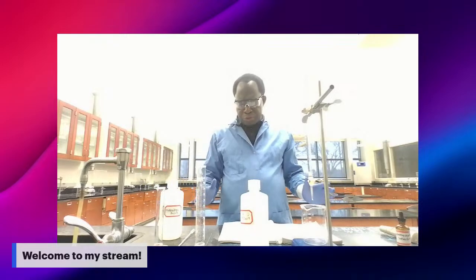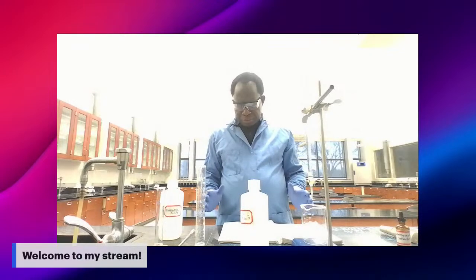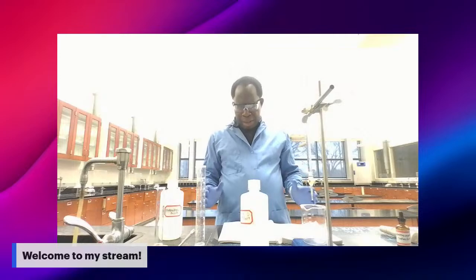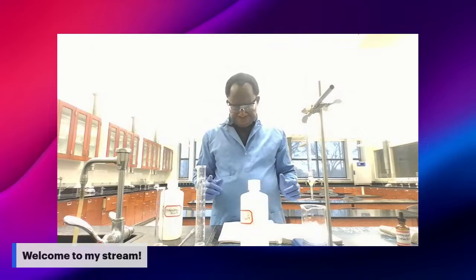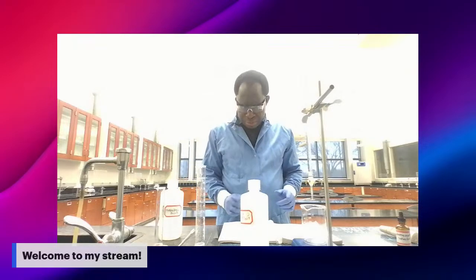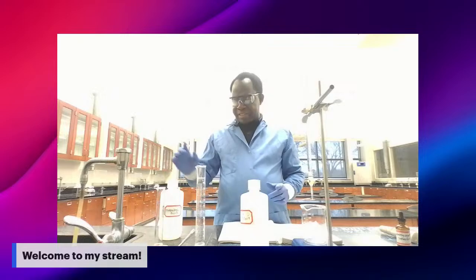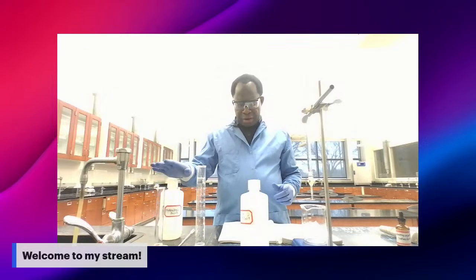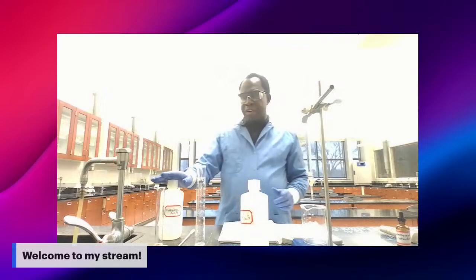Now you can move to part one, where you have to prepare the unknown acid. How are you going to do that? Your procedure is asking you to get 25 milliliters of unknown acid.